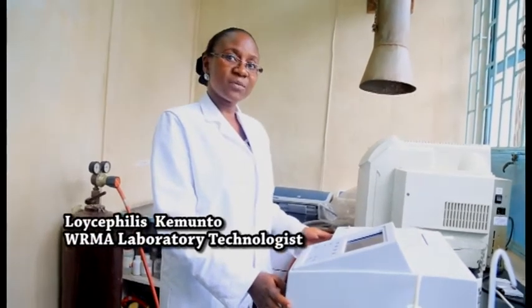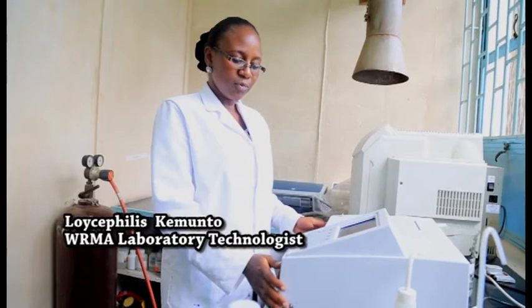This machine is a UV spectrophotometer, which uses absorbance to get the concentration of water. You can use it to measure most of the ions like nitrates and sulfates. Basically, I can demonstrate for you.